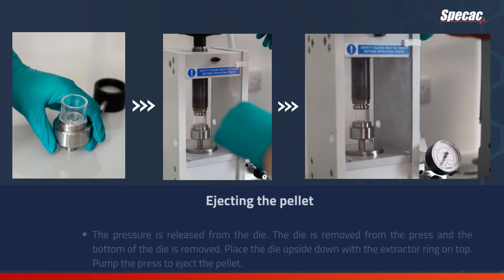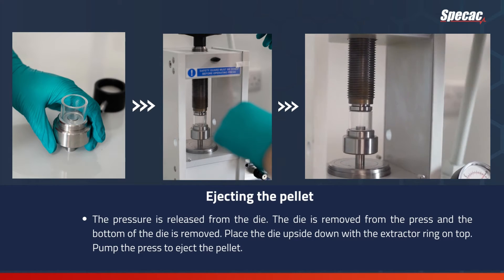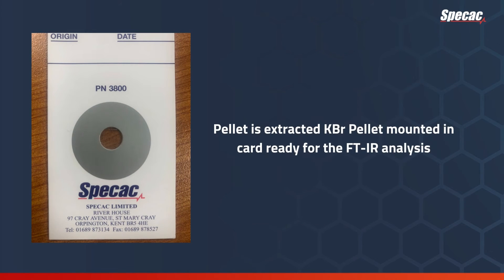To eject the pellet, the pressure is released from the die. Place the die upside down with the extractor ring on top. Pump the press to eject the pellet. Finally, the extracted KBR pellet is mounted in a SpecaCard and is ready for FTIR analysis.